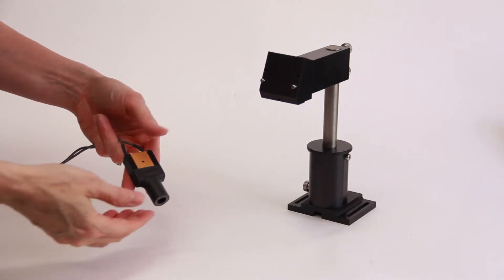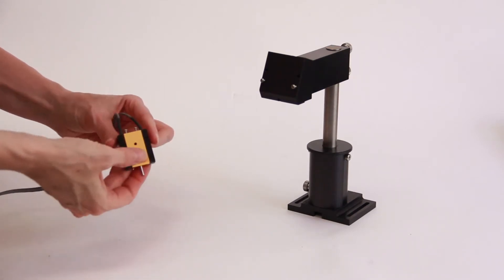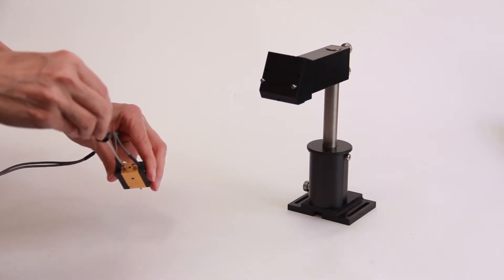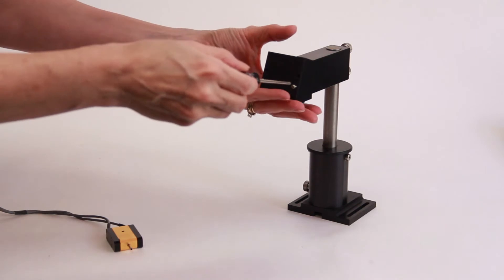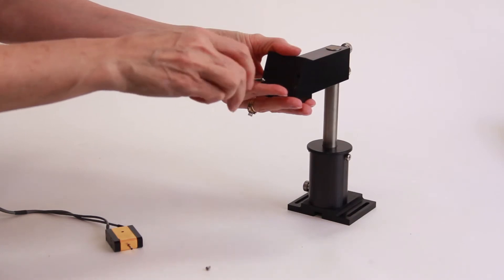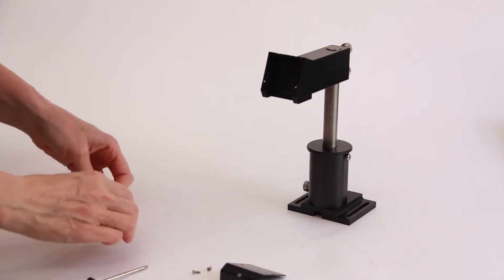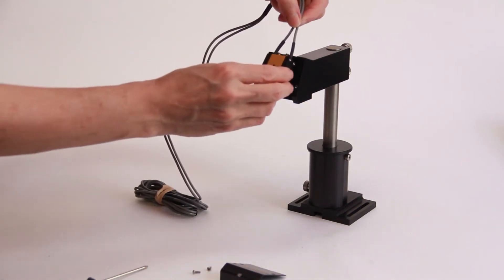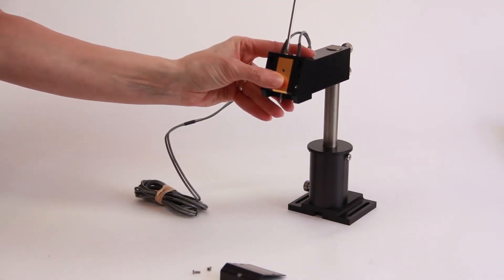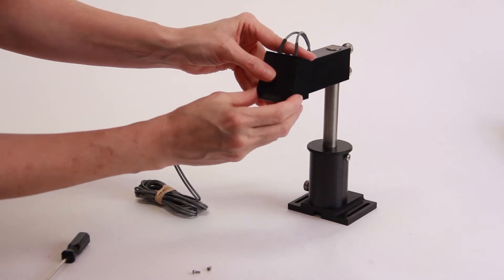To install the force transducer, remove the protective covers from the force transducer. Loosen the two screws on the top of the KG force transducer. Remove the two small screws on the face of the force transducer mount and remove the cover. Position the force transducer in its mount. Tighten the two force transducer screws to hold it in place. Reinstall the cover and secure it with the two screws.